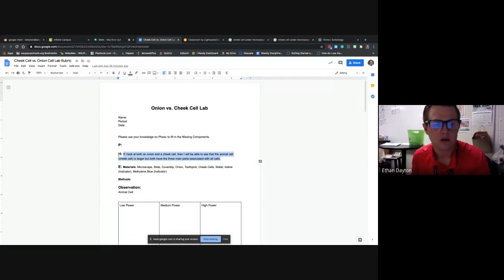Thank you. All right. So hypothesis: if I look at both an onion and cheek cell, then I will be able to see that the animal cell or cheek cell is larger, but both have the three main parts associated with all cells. Okay? So if I look at both an onion and cheek cell, then I will be able to see that the animal cell or cheek cell is larger, but both have the three main parts associated with all cells.